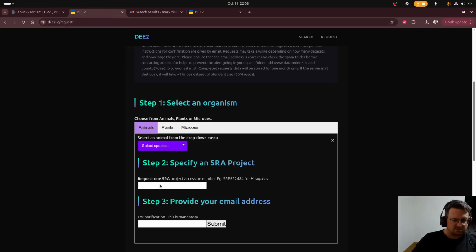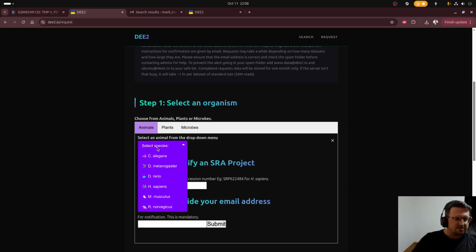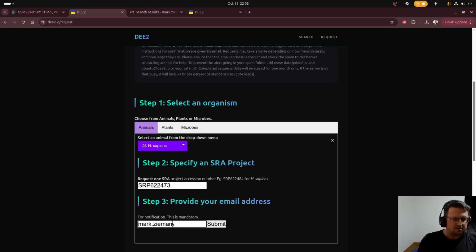I'll select that one, and we'll go over to the search query, the request tool, paste in that number and then the corresponding organism, and then we will put in our email address.